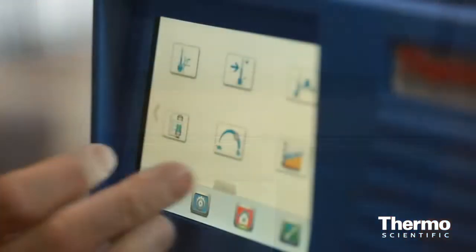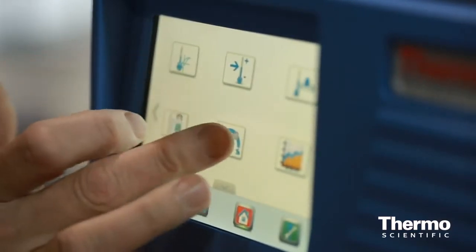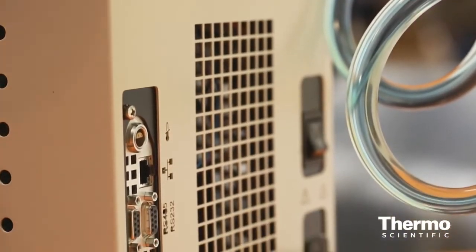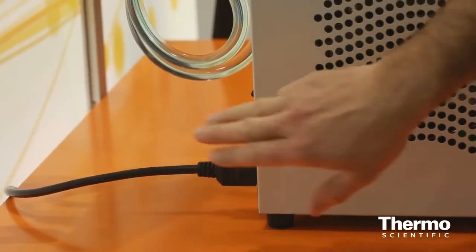The lid, the rack, the touch screen, the communications, and one other big one that we have is the global voltage. It's one part number. Automatically detects the input voltage. You put the appropriate line cord on the back, and this will work in any lab anywhere in the world.